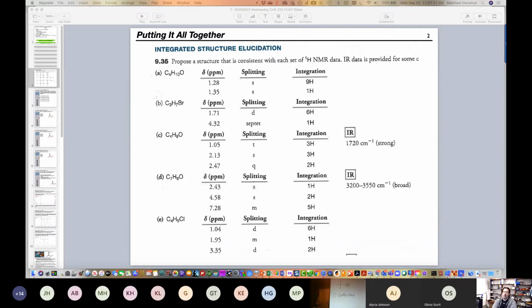What's another functional group with oxygen that has no degrees of unsaturation? So Ian says an ether. So yeah, within just simple thought processes here of molecular formula, degrees of unsaturation, consideration of the elements in functional groups, we've arrived at OH or ether. So Max says, I think it's a tertiary alcohol. So if you want to go ahead and draw a structure and show it in your camera window.